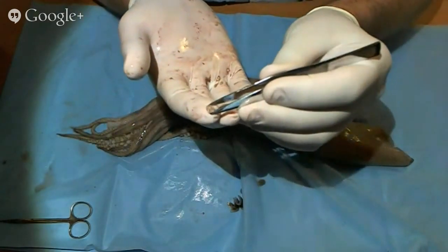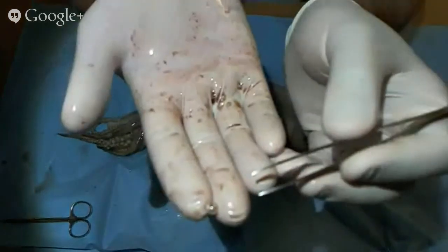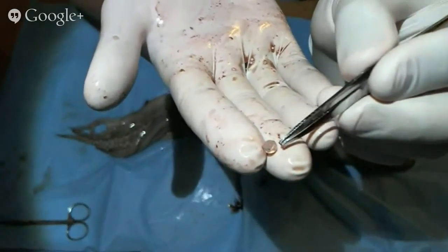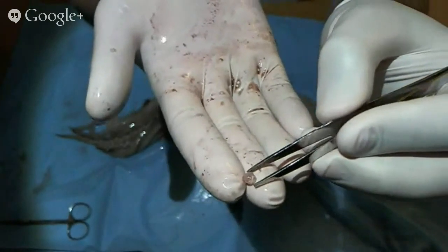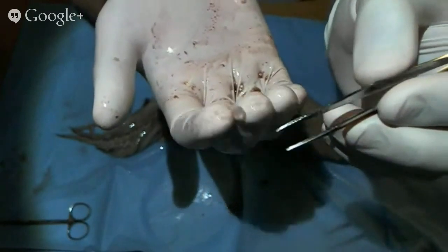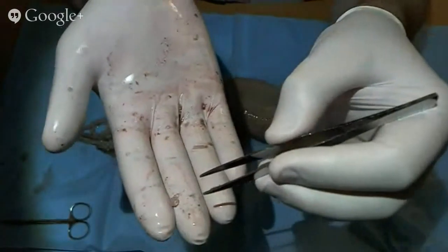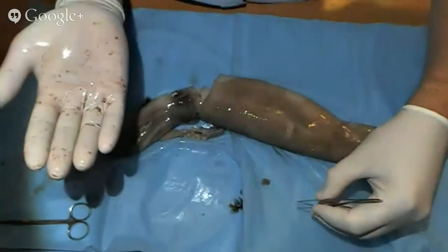So the squid's eyeball, what we notice too is we've washed this several times, and we've seen that when you take away all the extra stuff, it actually has lots of layers. It's made almost like an onion, where it's layered together in different pieces, which gets pretty cool when kids look at this and they start seeing that everything is almost the same in the squid. Then it sort of is a pretty cool epiphany.